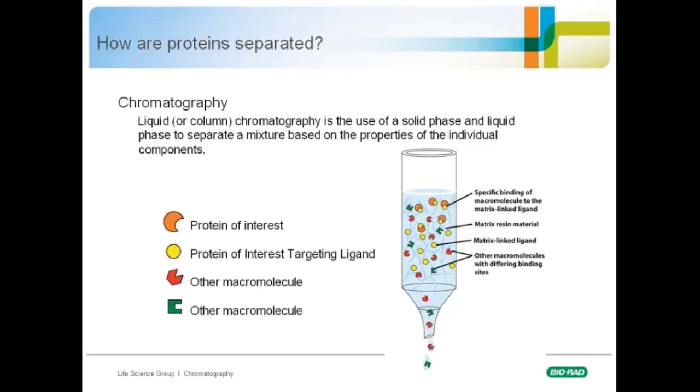In this illustration, you see that many of the proteins in solution do not interact with that ligand. And that's actually the intended purpose here. We only want to capture the protein of interest.